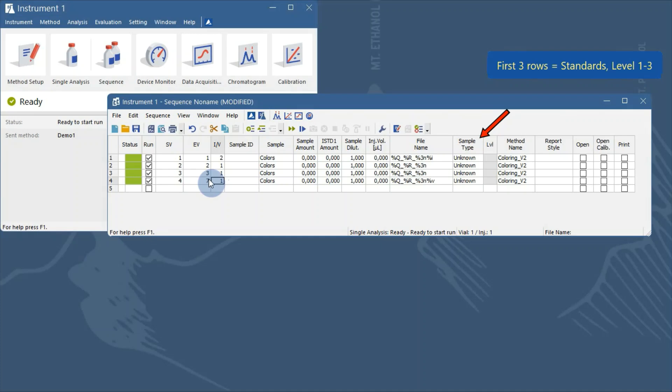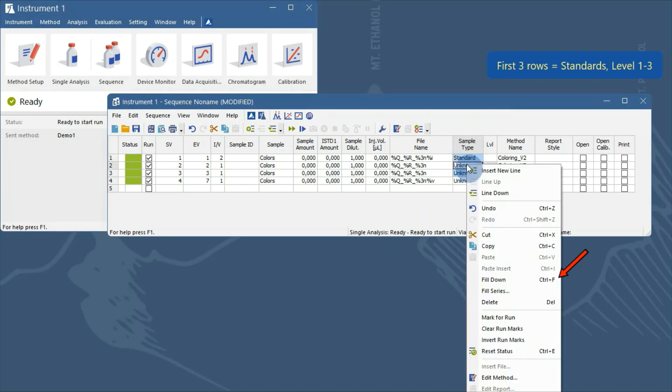The first 3 rows will be standards. So, we select the standard type in the first row and the sample type cells in the first 3 rows. Right click to invoke the local menu. Select fill down.